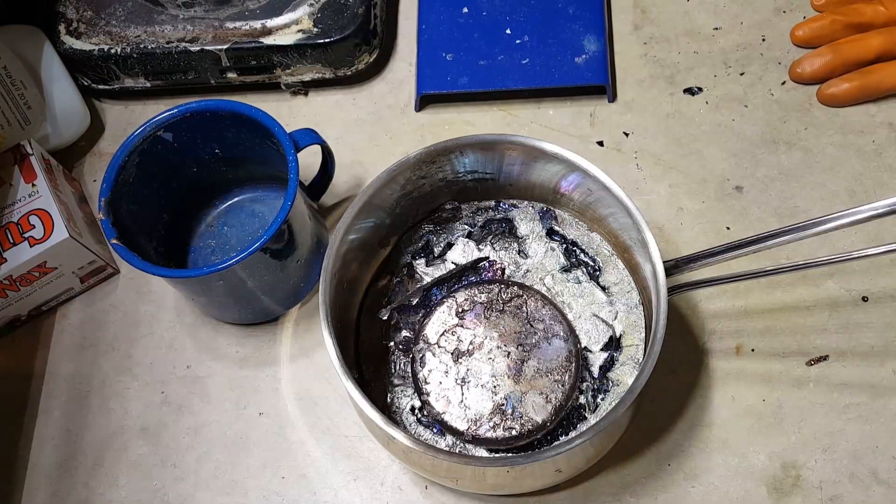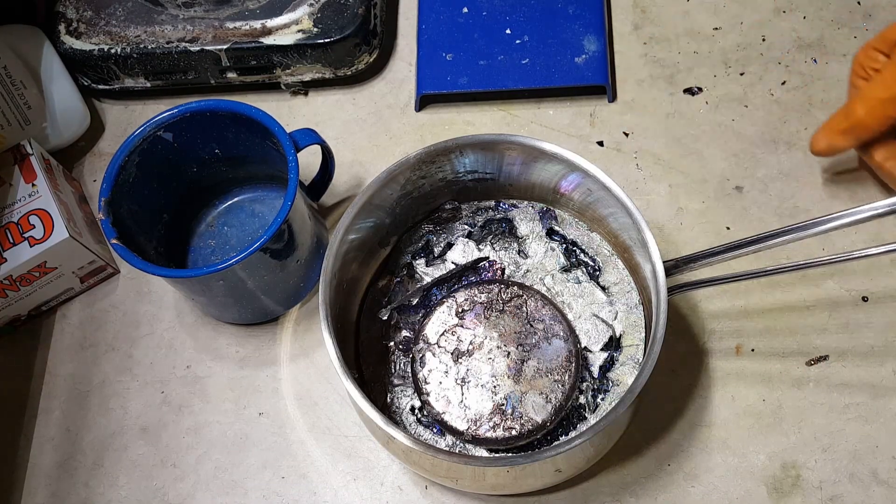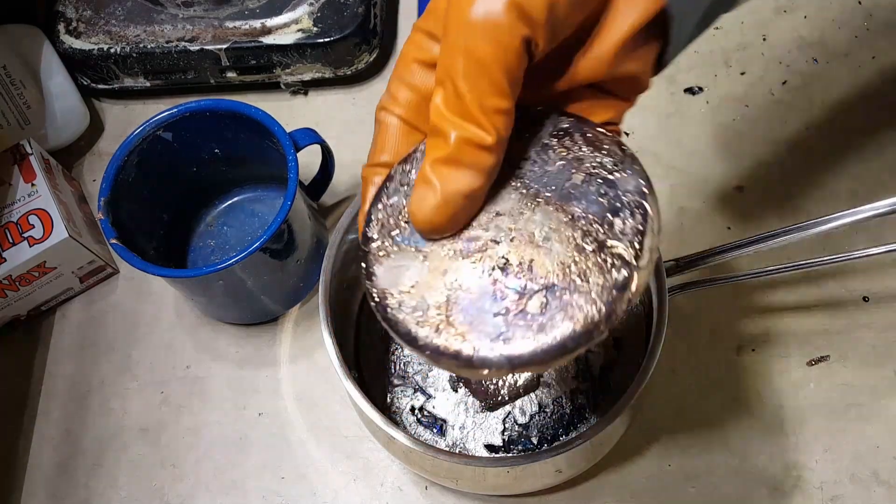Hi everyone, Frankie here and today I'm going to be showing you how to make bismuth crystals. I've got about a three kilogram piece in this pot right here. Here's the metal up close.